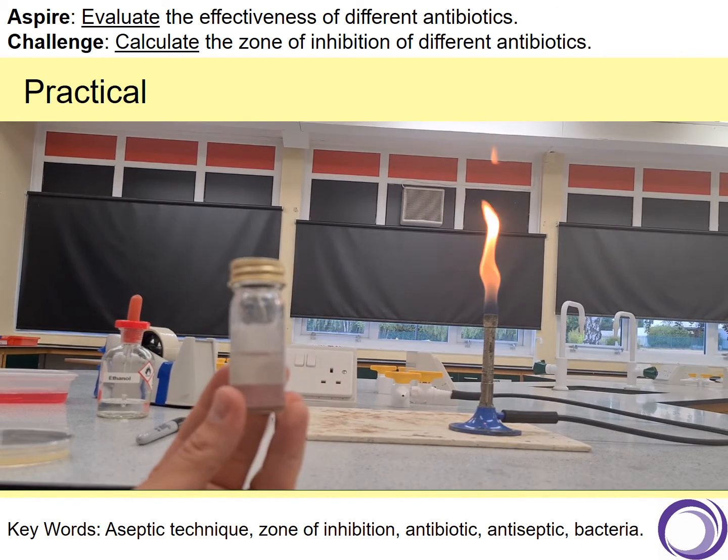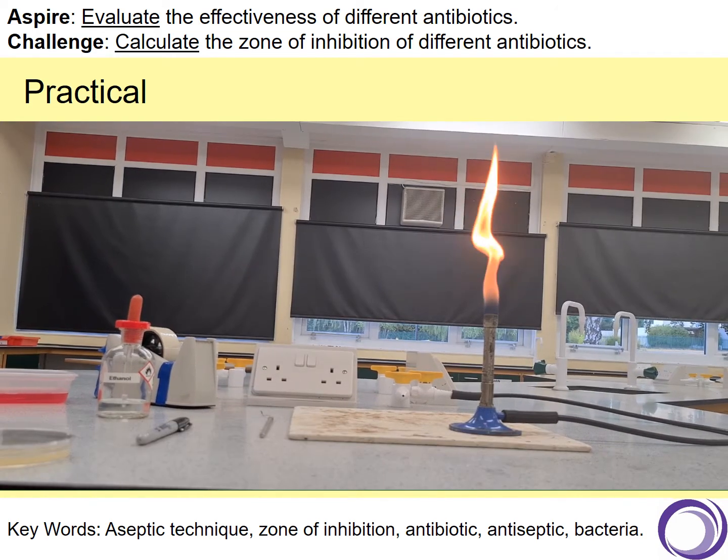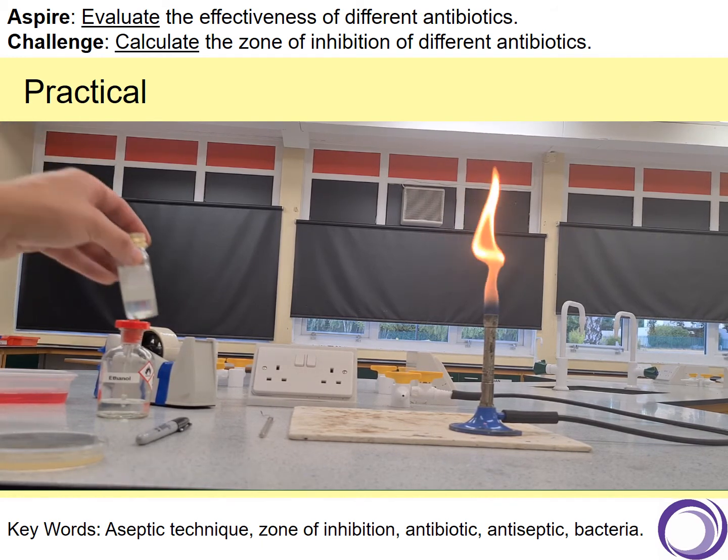Let's say we want to try and find out what kills the coronavirus. If we grow loads of coronavirus on our agar plates, it wouldn't quite work like that, but a bacteria better, then we can put different things on it and we'll see if it kills it. So we can spray Dettol on and see if Dettol kills it. And that's what this is about, growing one type of bacteria and seeing what works against it.